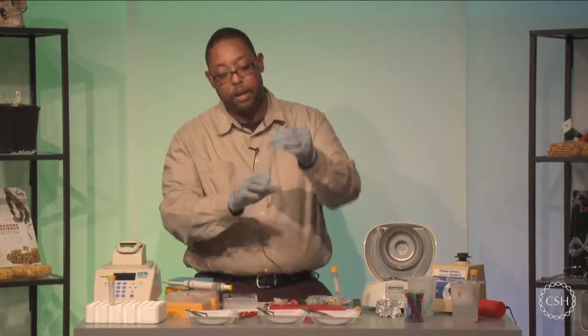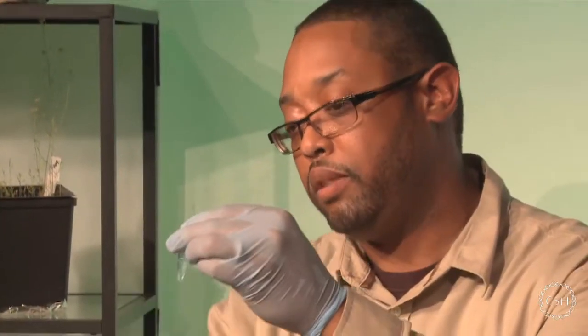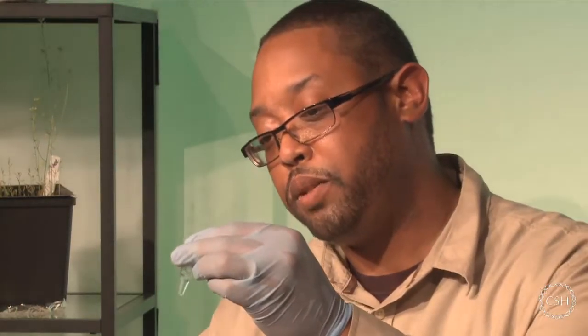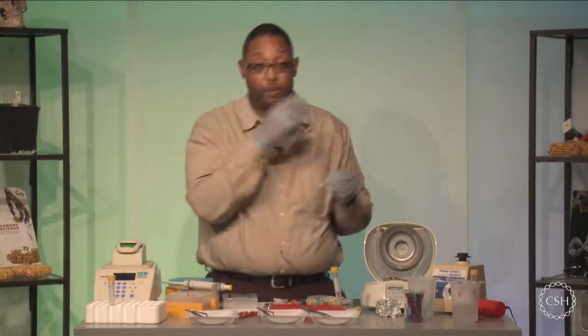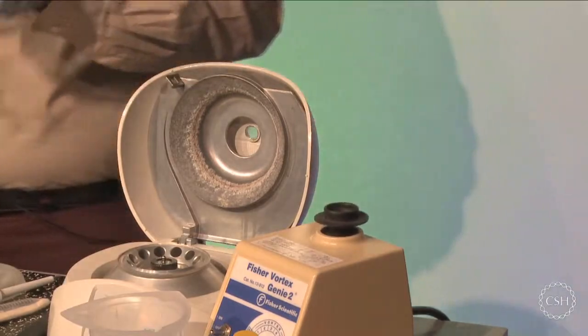So when I'm in here, I can either finger vortex while I'm here, and I actually want to see that the pellet gets moved or lodged. Okay. And it's actually starting to dislodge now. It may take a few taps, but there actually is a pellet physically in there moving around. Okay. Now, if you don't want to finger vortex, of course we can use the machine, which actually would be much easier to do overall. And that gets dislodged pretty easily.